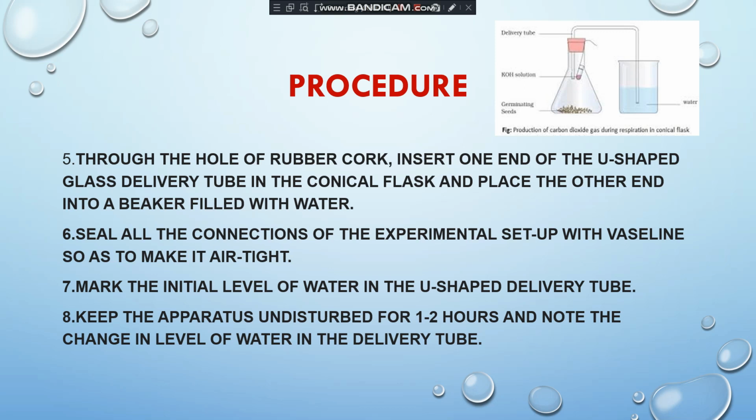Now we have to mark the initial level of water in the U tube here. We have to mark, okay, this is the level of the water. Then next point, keep the apparatus undisturbed for 1 to 2 hours and note the change in the level of water in the delivery tube.